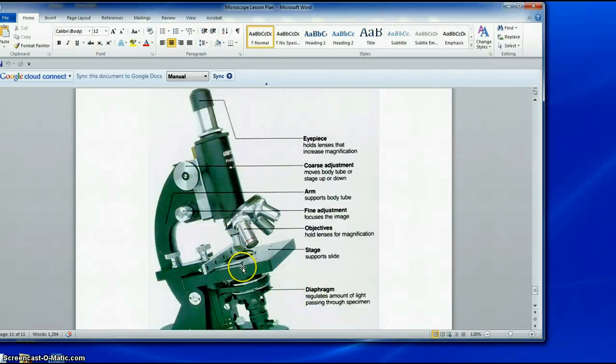after you've become familiar with the apparatus, we want you to take slides that will be on the lab tables that are prepared slides. They are labeled as to what you should be looking for in those slides. Put them on the microscope. Start with low power. Center the object on the field of view by putting it at the end of the pointer that's embedded within the lenses. Then, when you carefully switch to a higher objective lens, the item will be centered, and all you have to do is carefully and properly focus to find it so that you can examine it.